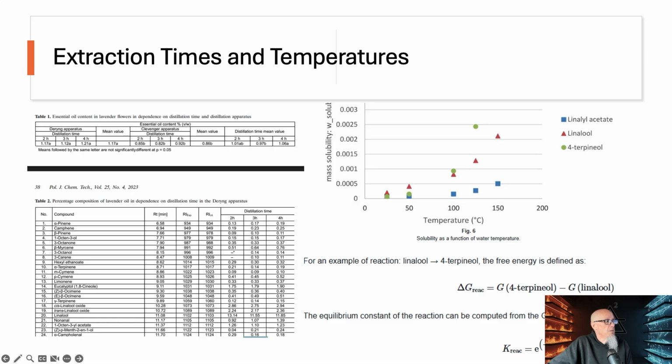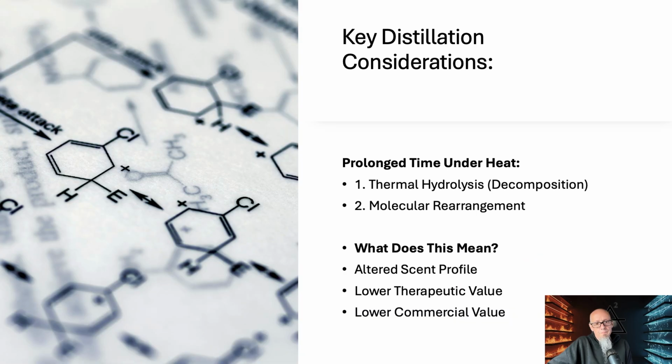Okay, so on the left at the very, very bottom, you'll see linalool with the actual distillation times. Those distillation times are horrible, right? 2, 3, 4 hours, that's a lot for lavender extraction.